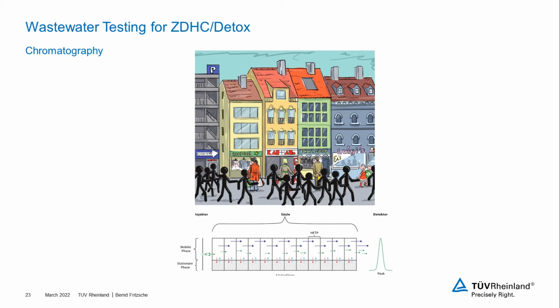So what happens here, and why do we have this kind of separation? We can imagine this in simple ways, like a family that walks through a shopping mall, starting from the entrance and agreeing to meet up at the ice cream shop. So the family consists of mother, father, daughter and 2 young kids. So they will start out, and if the shopping mall consists mainly of fashion shops, you will probably have the kids run through, quite uninterested of all the shops, to the ice cream shop and arrive there first.